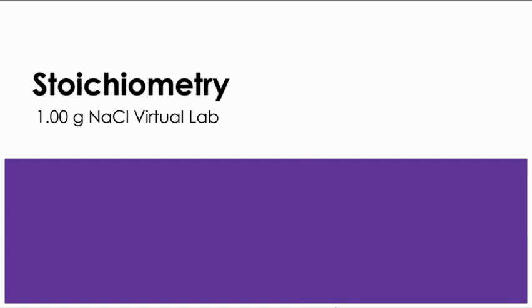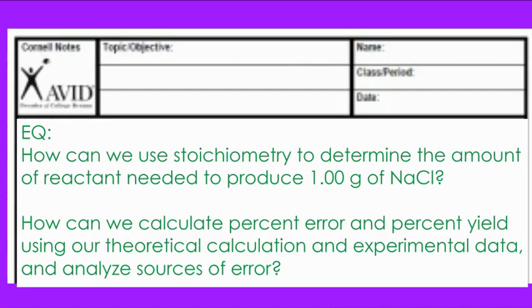I'm one of the chemistry teachers at Eagle Crest, and today's podcast is the virtual lab for the 1 gram of salt lab that we are doing in class. If you were absent, hopefully this lab will help you get a data set and familiarize yourself with the actual lab procedure. We have two different essential questions for this lab.